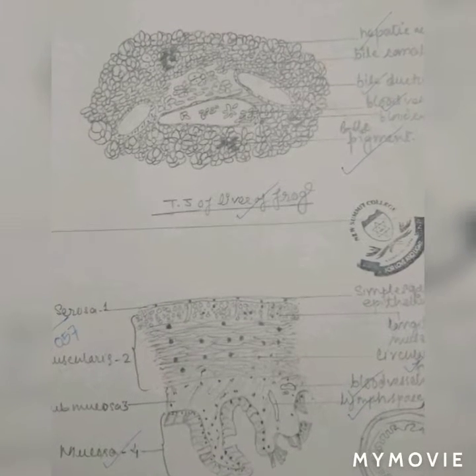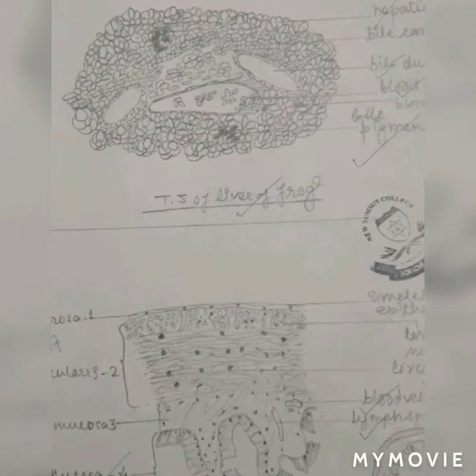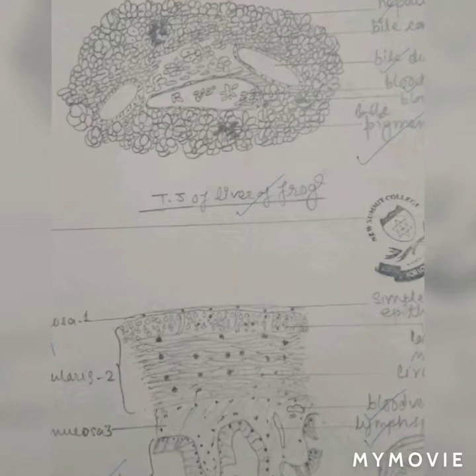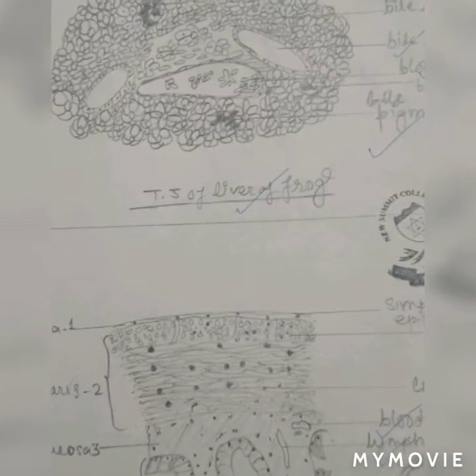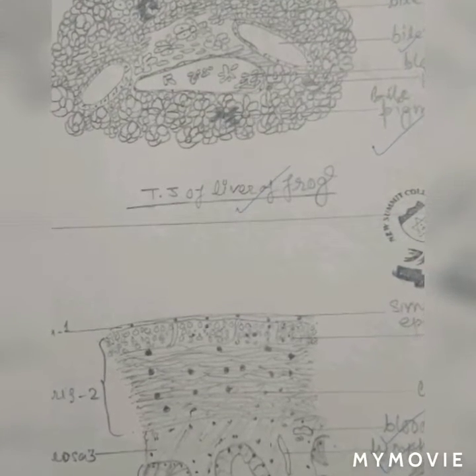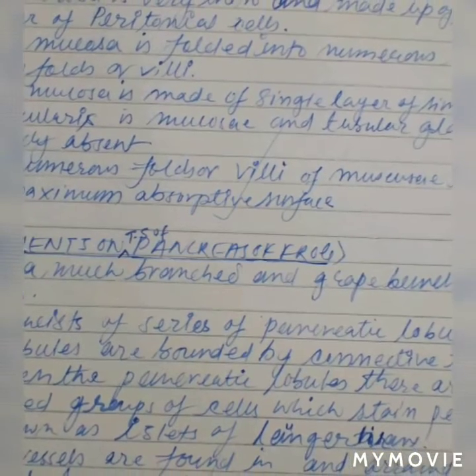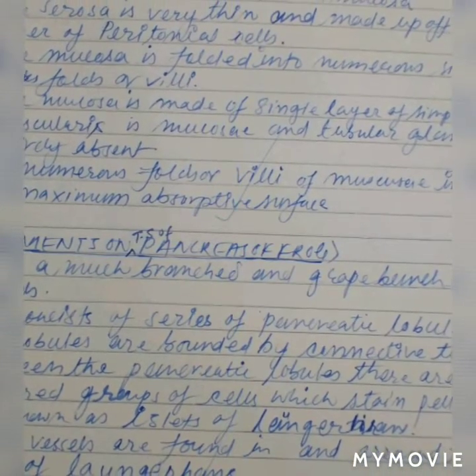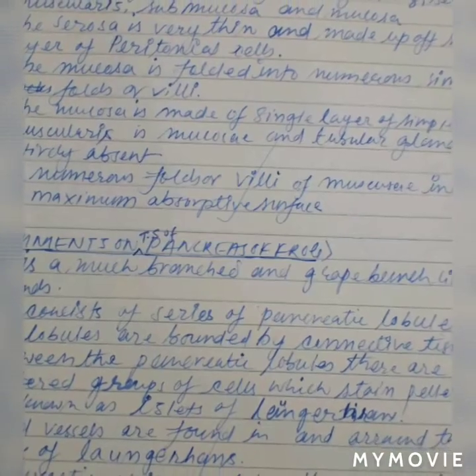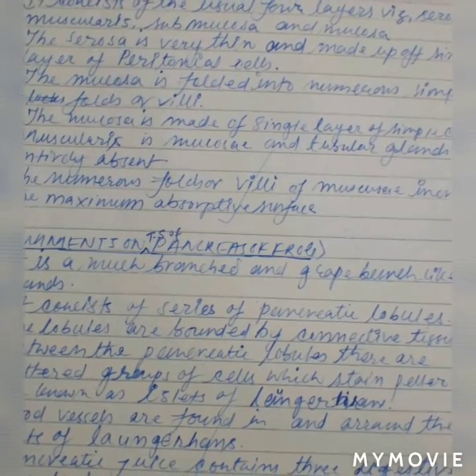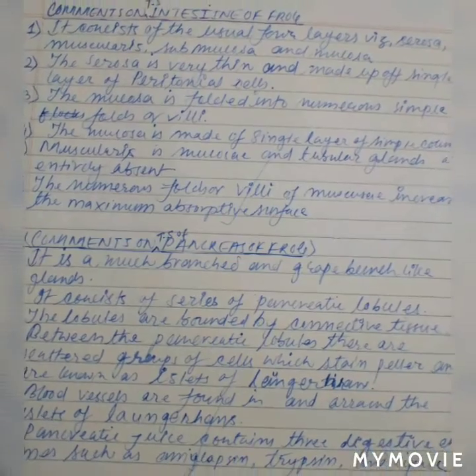The outer longitudinal muscle fibers are thin and the inner circular muscle layer is thick. The sub-mucosa lies below the muscular layers and is composed of a thick and broad layer of loose connective tissue fibers. The mucosa is thrown up into folds which give rise to secondary folds. Thank you.